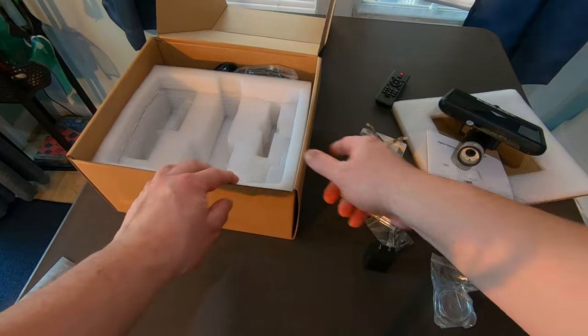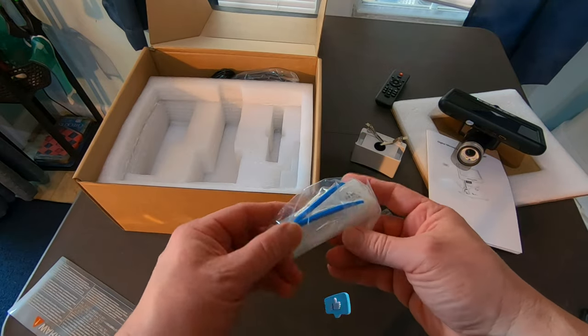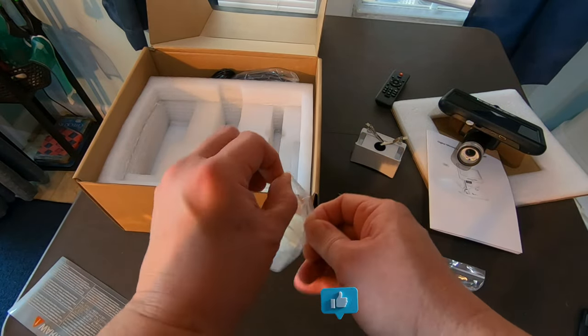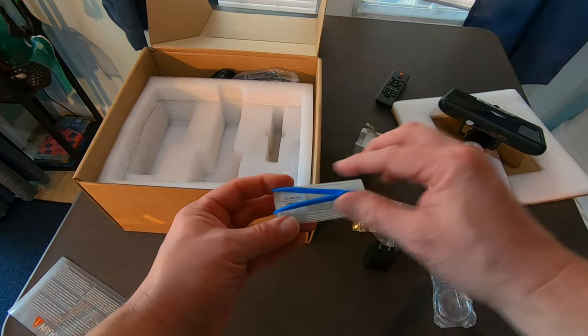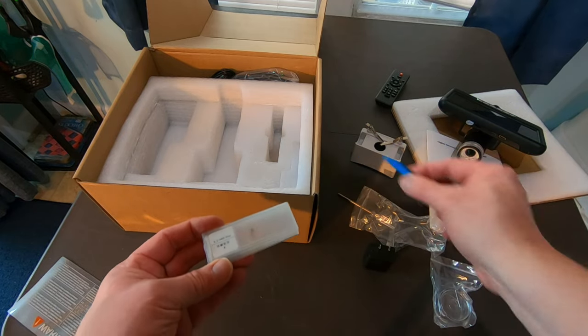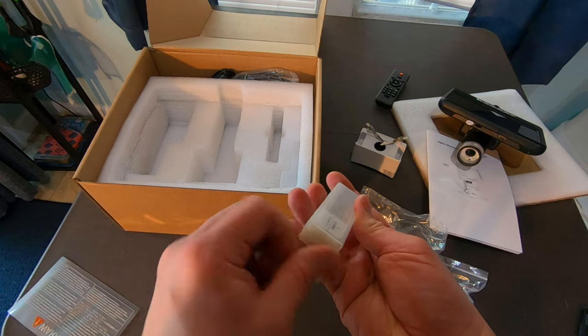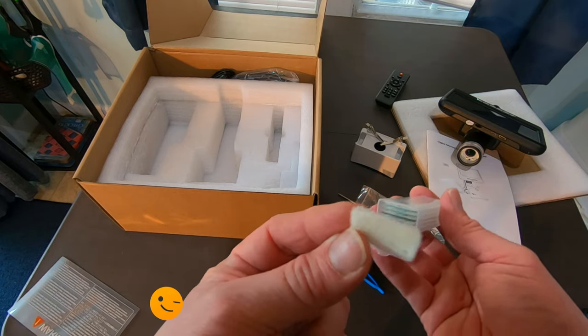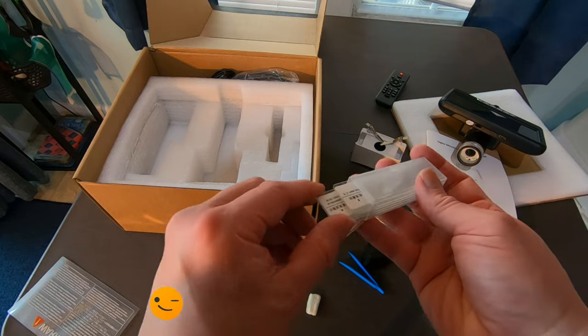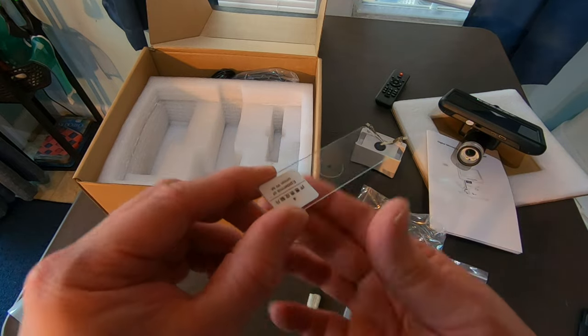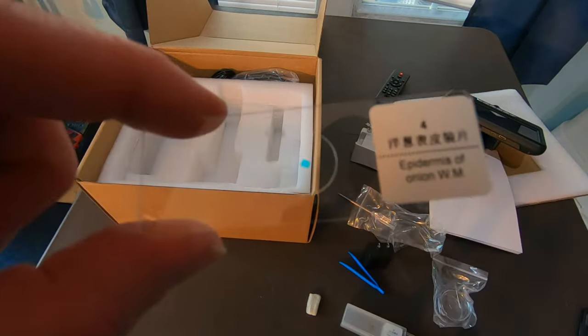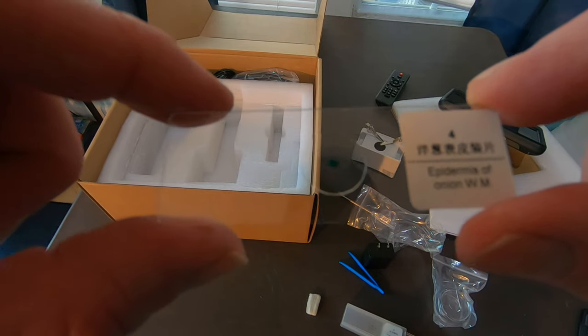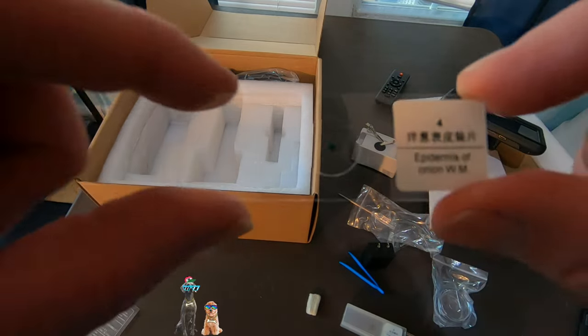Remote control. Take a look what else we have here. Nice. Oh, I'm glad. Okay. So we do have some sample slides that we can look at, tweezers to pick up elements. And here's our slides. Okay. We can look at this under the microscope too. So we have some sample slides here. Let's take a look at what we have here. This is going to be epidermis of the onion. Nice.